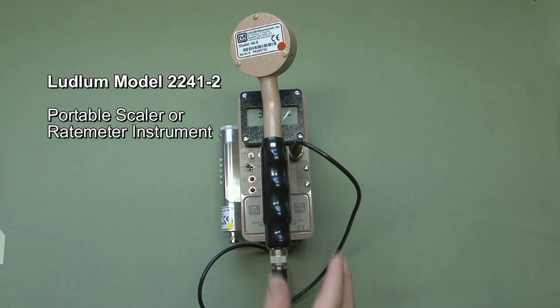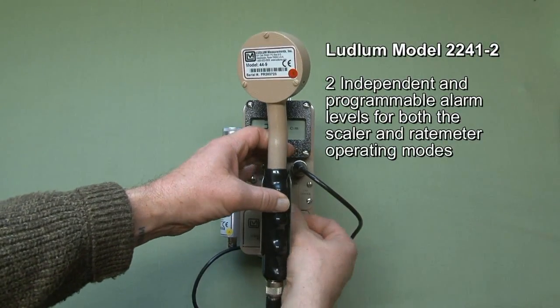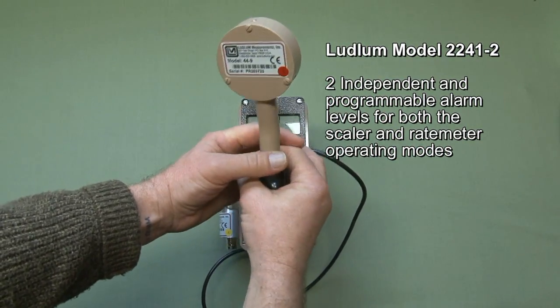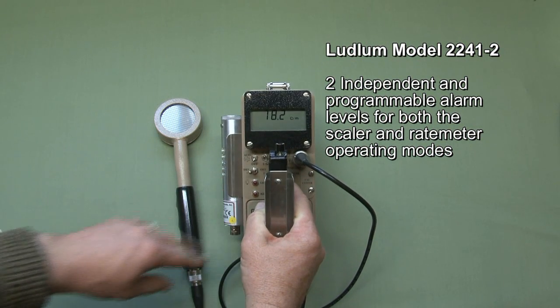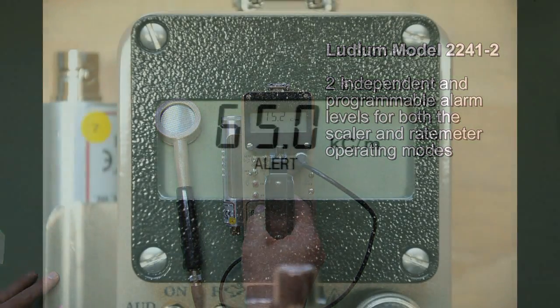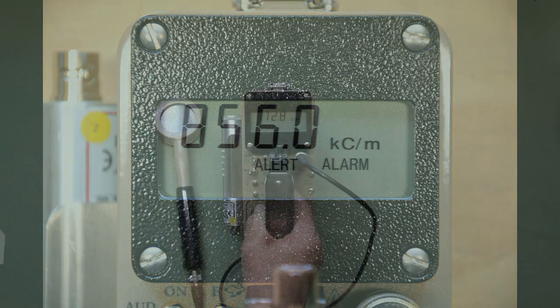The instrument can be operated in two different modes: as a rate meter or as a scalar, and it has independent adjustable alarms for both modes. The first alarm level is indicated by the word 'alert' on the LCD screen, and the second alarm level is indicated by the word 'alarm' and the emitting of a continuous alarm tone over the speaker. That alarm will sound whether you've got the audio turned on or off.